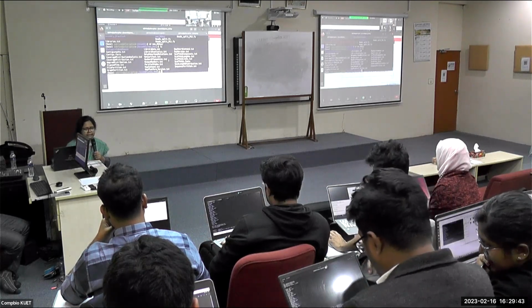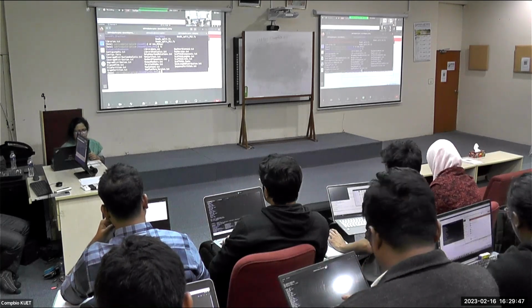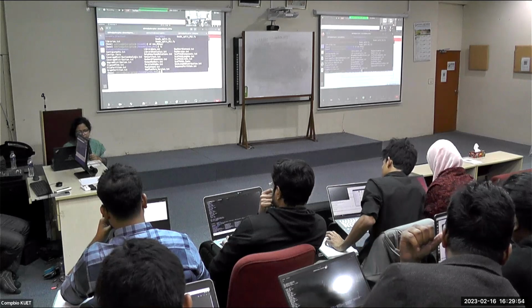Sometimes we need to assess the quality of the assembly. And for that, we need those statistics that were generated.